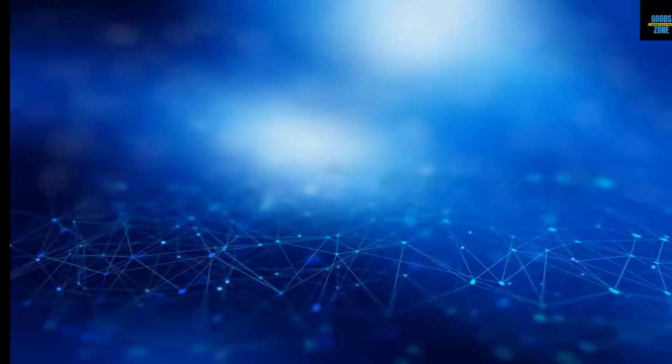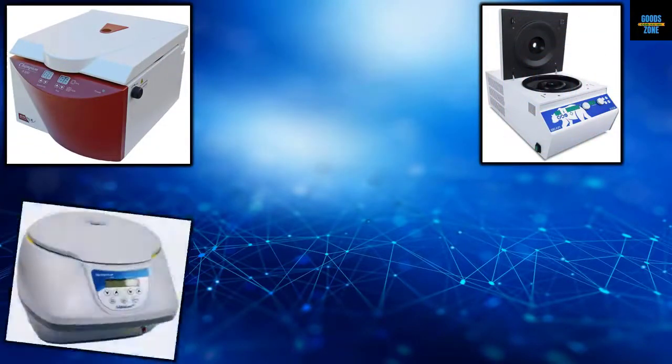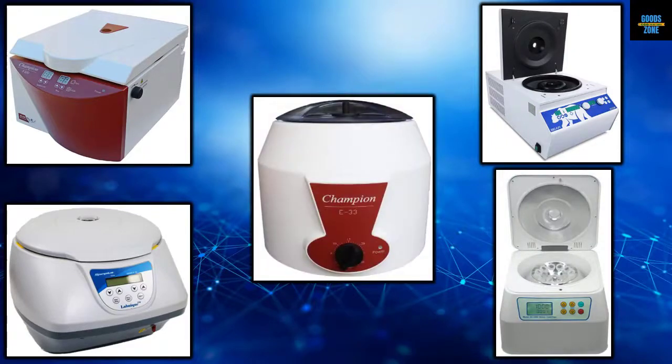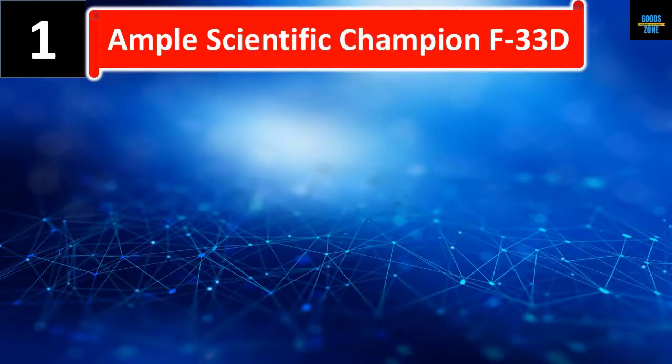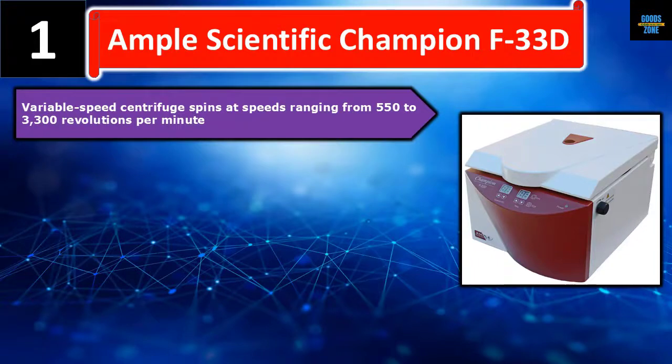In this video we list five best benchtop centrifuges. We talk about the details and features of these benchtop centrifuges. Let's get started. Number one: Ample Scientific Champion F-33D variable speed centrifuge, which spins at speeds ranging from 550 to 3300 revolutions per minute.